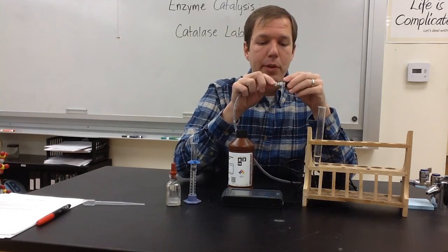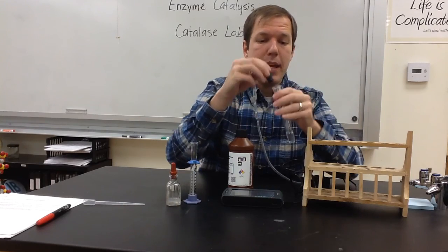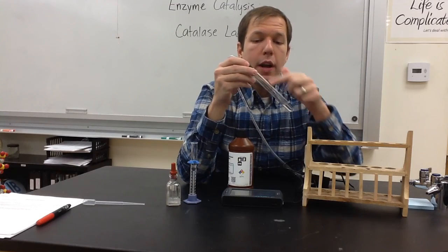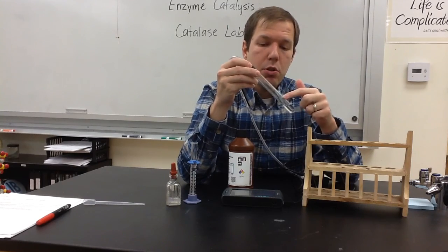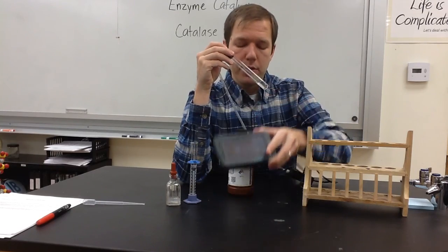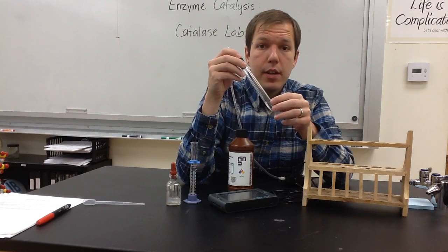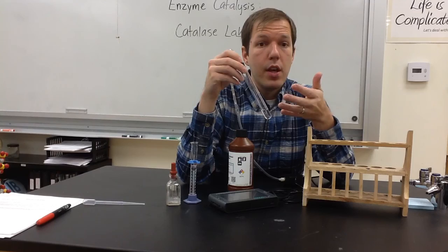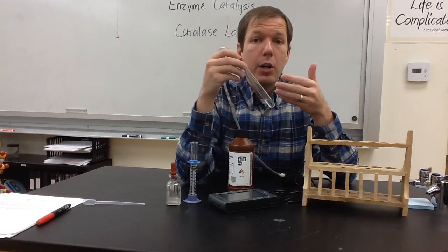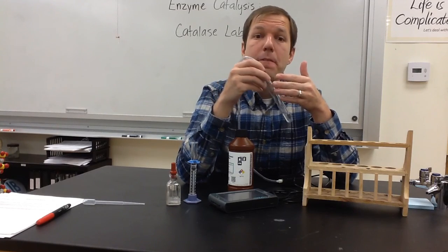attaching a rubber stopper to the end of the tube, and now putting the stopper, which has a hole in the bottom, into the test tube, whatever the pressure is inside this glass tube of the air that's trapped within there is being recorded on my LabQuest. So as the hydrogen peroxide decomposes here, it's going to produce oxygen gas. That oxygen gas will be added to the air above the tube, increasing the number of molecules in a fixed volume.